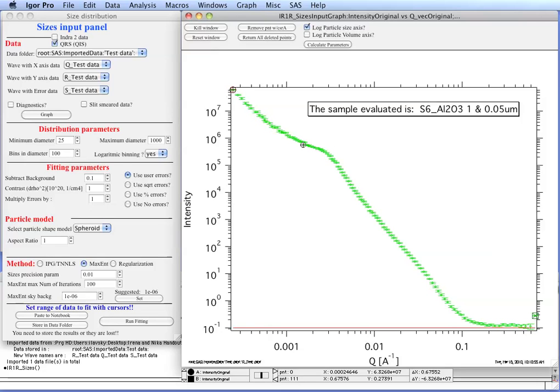So what we will do is move the cursor down here. We basically try to analyze this Guinier area, power law slope, this Guinier area. And then we move this one up here, because the data down here at the end contains very little information and we just confuse the code.